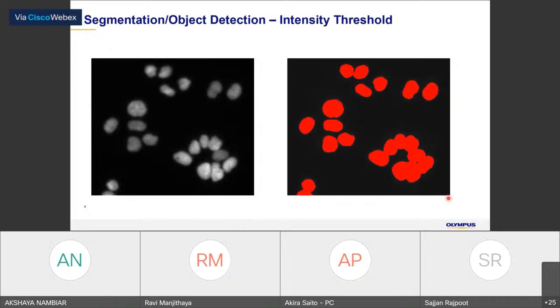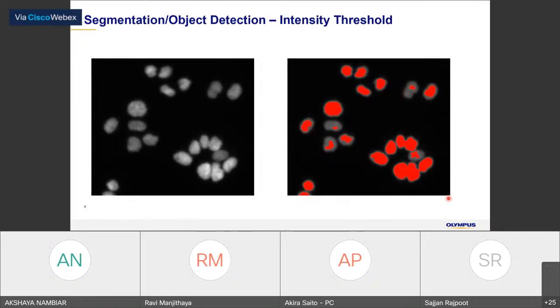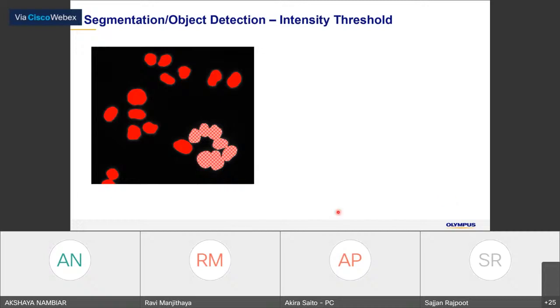Of course, if you are not doing proper thresholding, then the detection will be like this, so it is necessary to have the best thresholding to distinguish the background and the object. If you set it properly, then it should be like this. However, you can see that some of the nuclei over here are identified as a single object, where you can see 1, 2, 3, 4, 5, 6, 7 nuclei, but it is identified as one object.